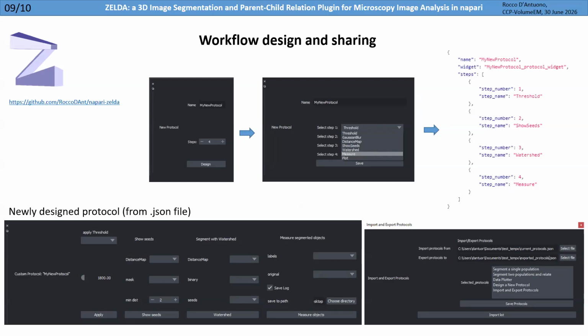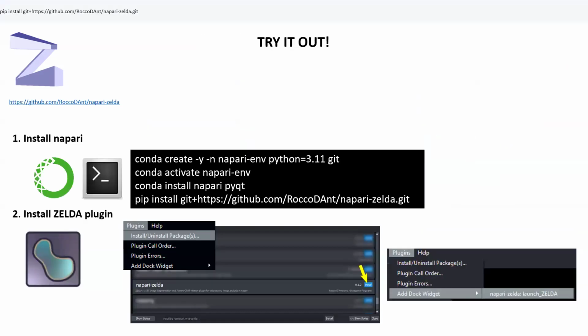Eventually, if one wants to add a new block, making use of the magicgui library in order to create some widget for napari, this can also be added in the list of the available blocks. So the plugin can be enriched also by users if they want to write a graphical part, and this can be integrated in existing protocols.